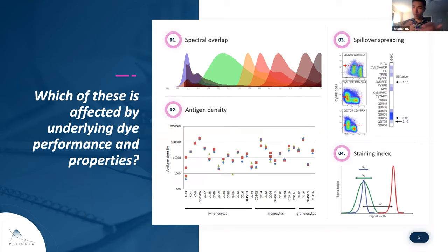In fact, hopefully I'll convince you today that even panel design itself is essentially subject to the compromises of these foundational dyes that we've had in the field for many, many years. And so we're going to try and think differently around that. So stay with me while we think about what the current dyes are. We'll focus that on a particular set of laser lines, which is where we started. And then we'll build that out paradigmatically, both from labels into panel design, and then describe some current work on going very, very high plexity, a high number of questions around each individual cell.